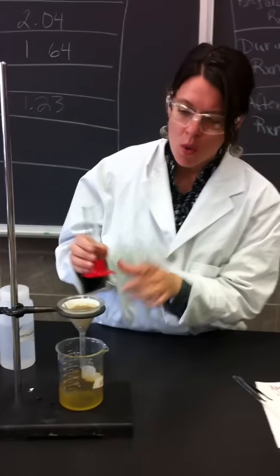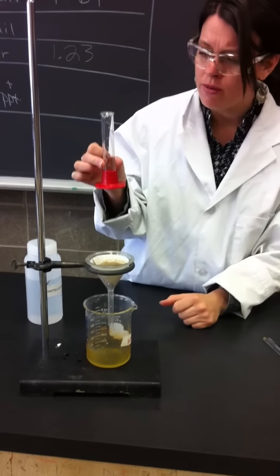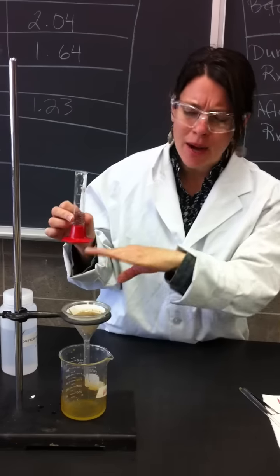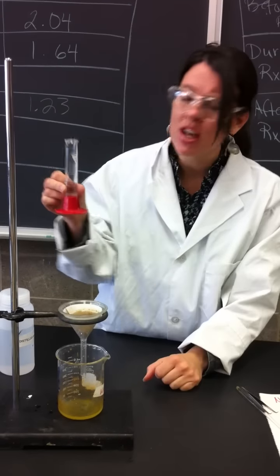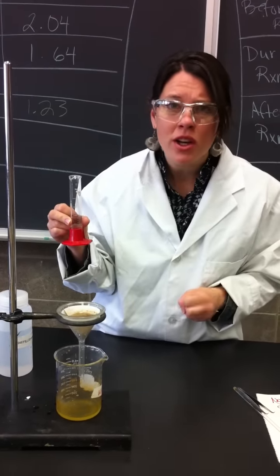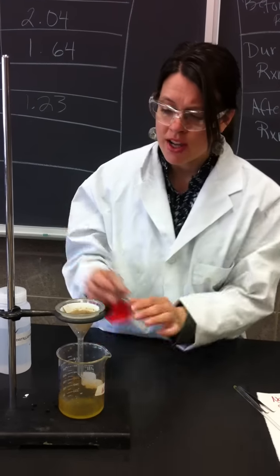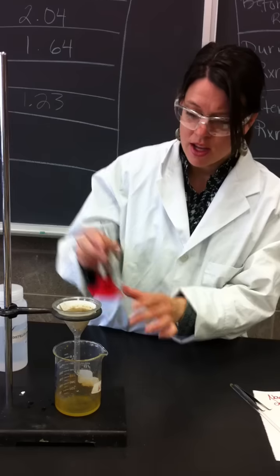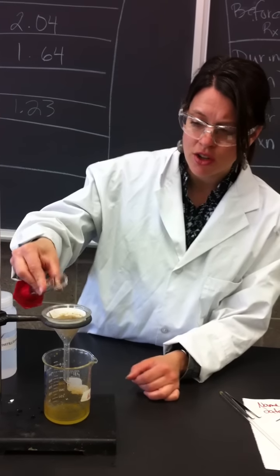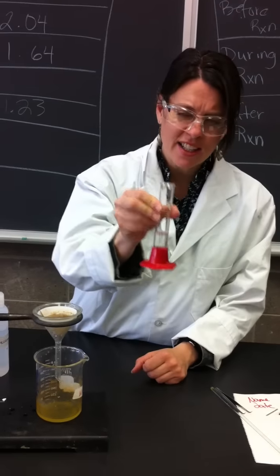All right. So when it gets down to maybe about a quarter of the volume, maybe even better when there's absolutely no liquid left, you wash it with the acid. The acid wash is just picking up any impurities that are sticking on the precipitate, and we'll put them into the filtration. Okay, so just imagine it's down low, and you can pour in your 15 mils of acid in a circular motion, trying to get the precipitate into the middle. Okay, so that's an acid wash.